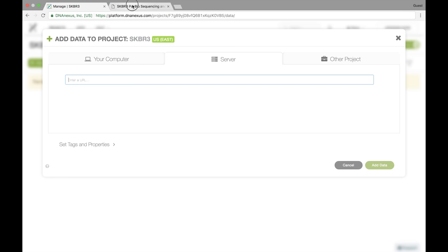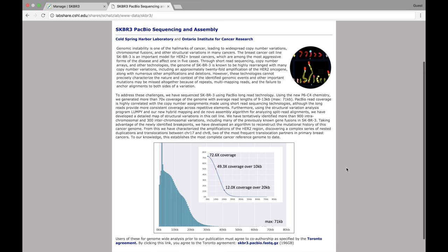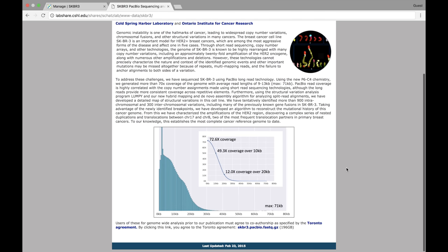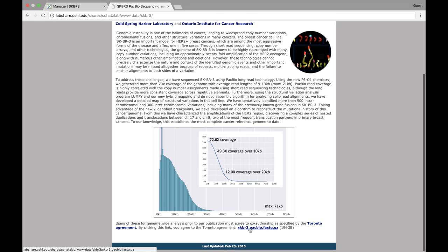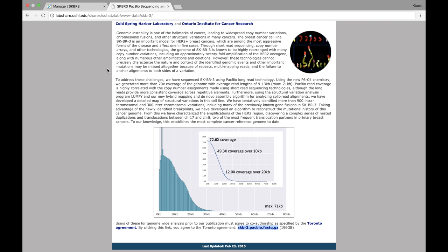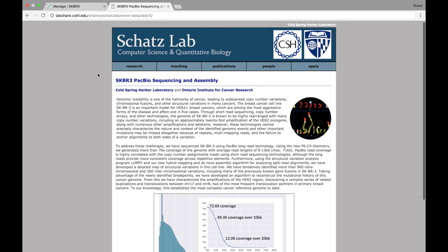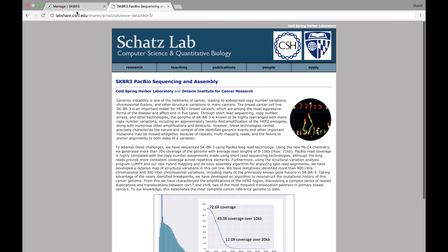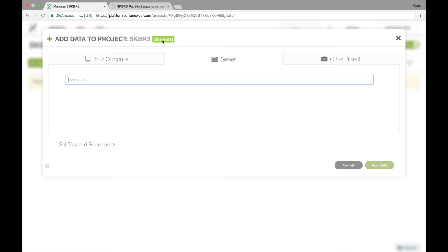So let's go over to this other tab where I have this website, and at the very bottom of this, I have a URL here, and if I right click on that and say copy link address, it'll give me the URL that I need in order to be able to upload that data to DNA Nexus.